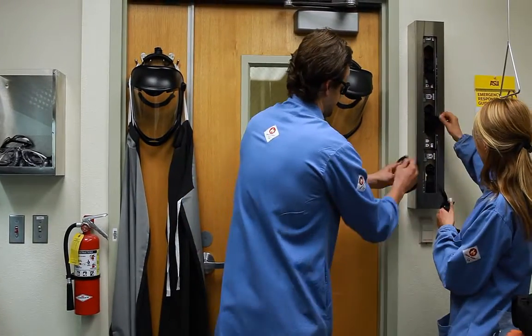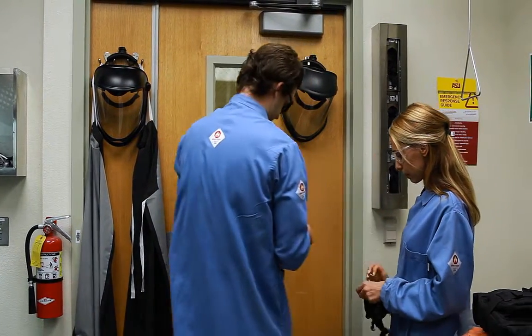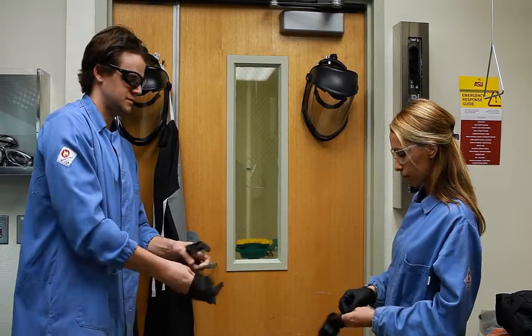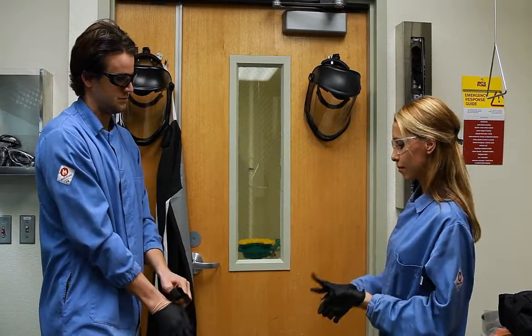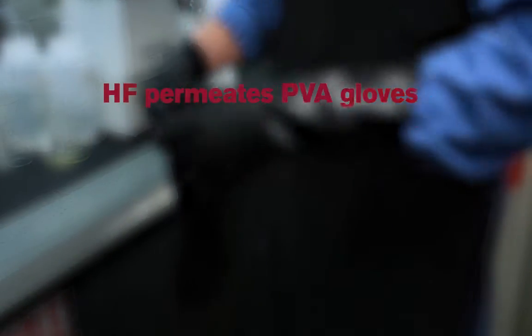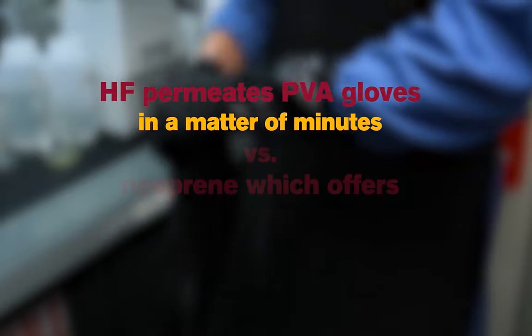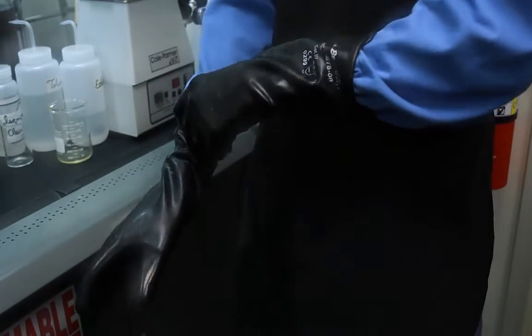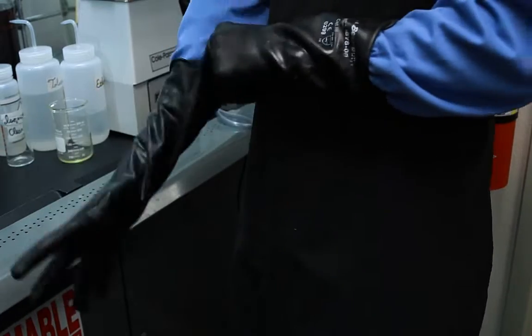Each set of gloves must be inspected prior to use, checking for defects such as holes or tears. HF permeates many types of glove materials aggressively. Therefore, using a compatible glove type is critical. For example, HF permeates PVA gloves in a matter of minutes versus neoprene, which offers greater protection. It is strongly recommended you double glove whenever working with HF.